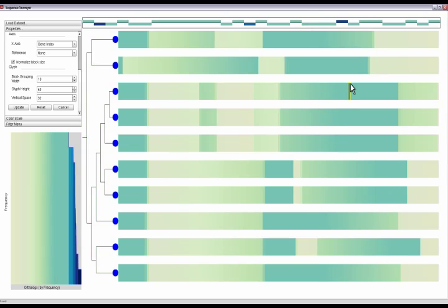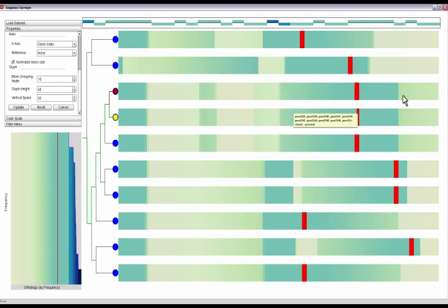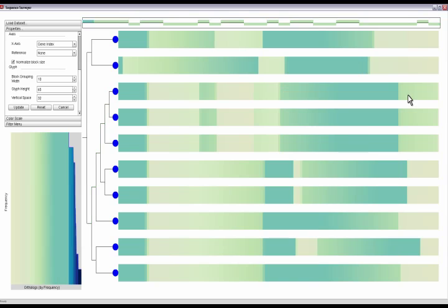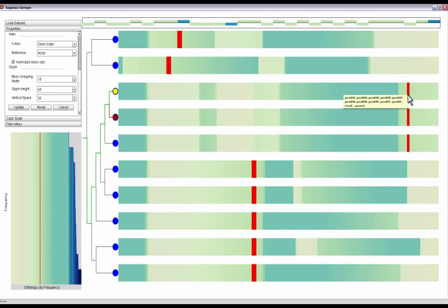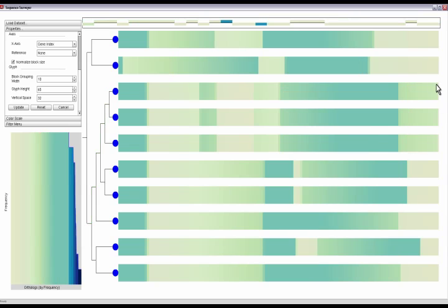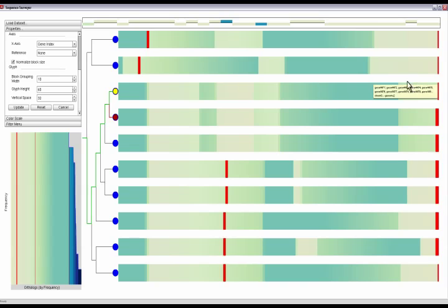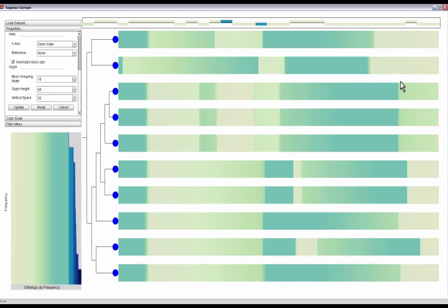Genes can be colored according to various properties. Here, genes are colored according to their frequency. Blocks aggregate the colors of the genes they contain.